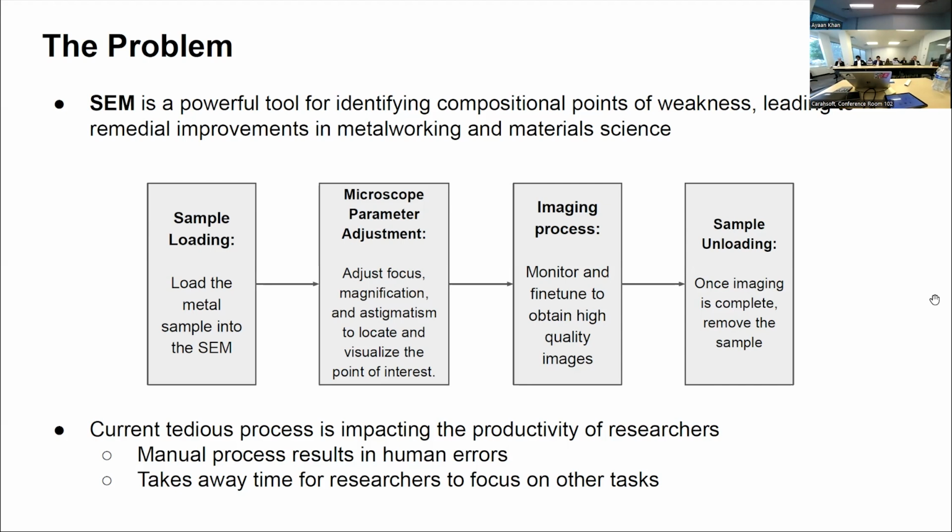But the slight issue with the SEM is that over a long period of time, it ends up being incredibly time-consuming for researchers to use.